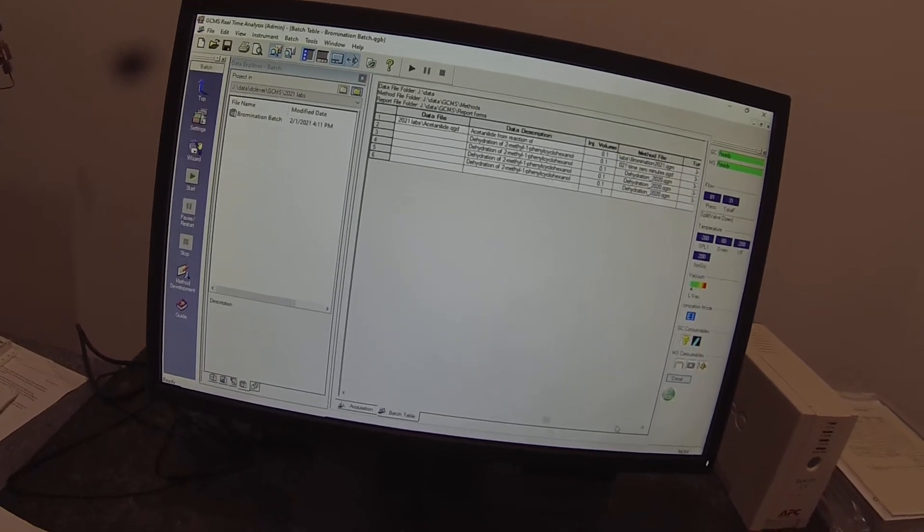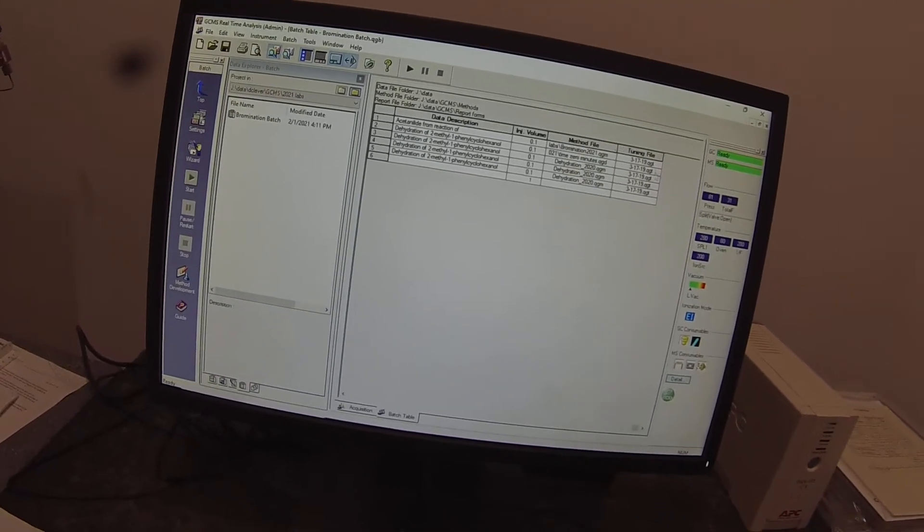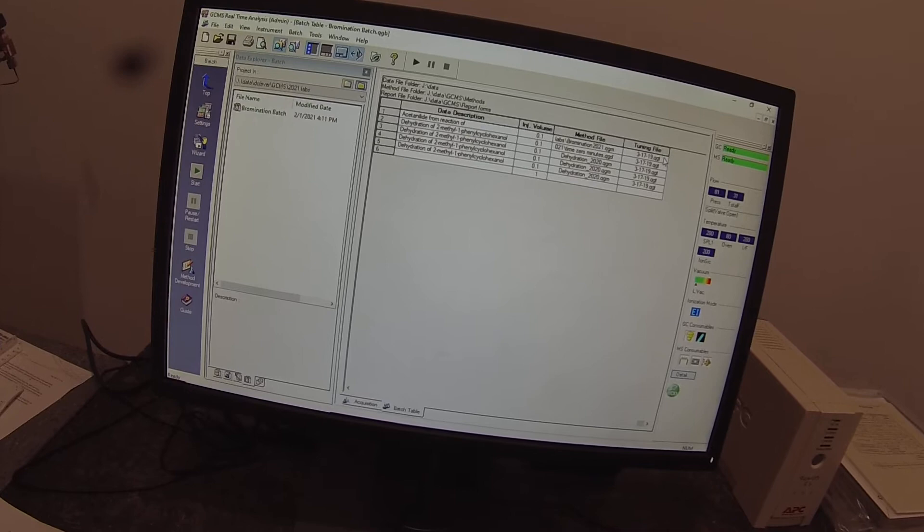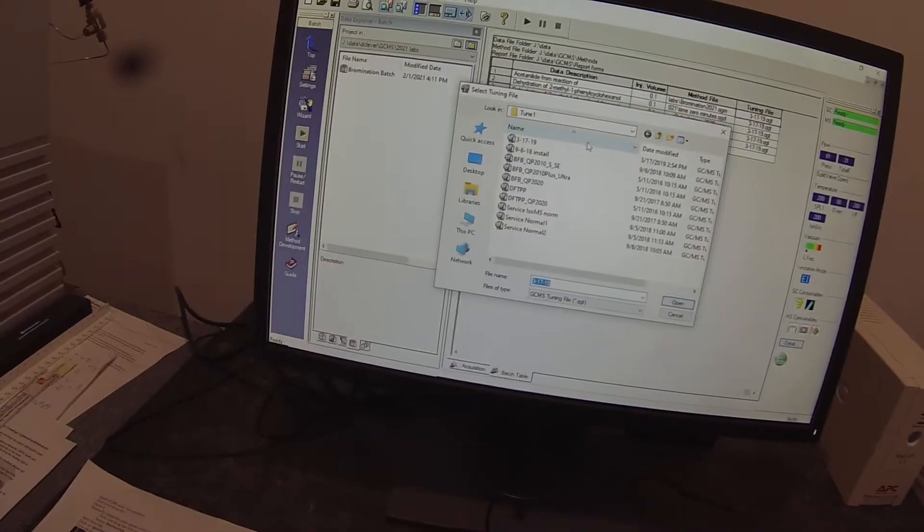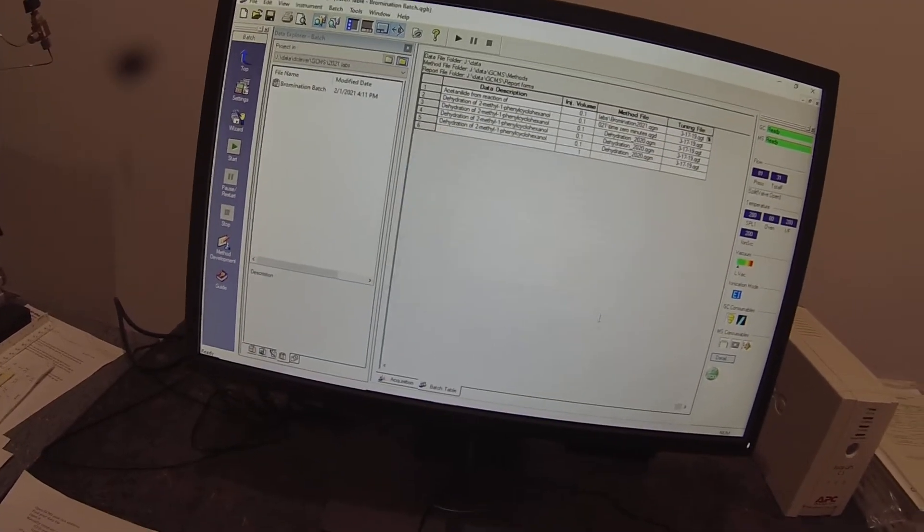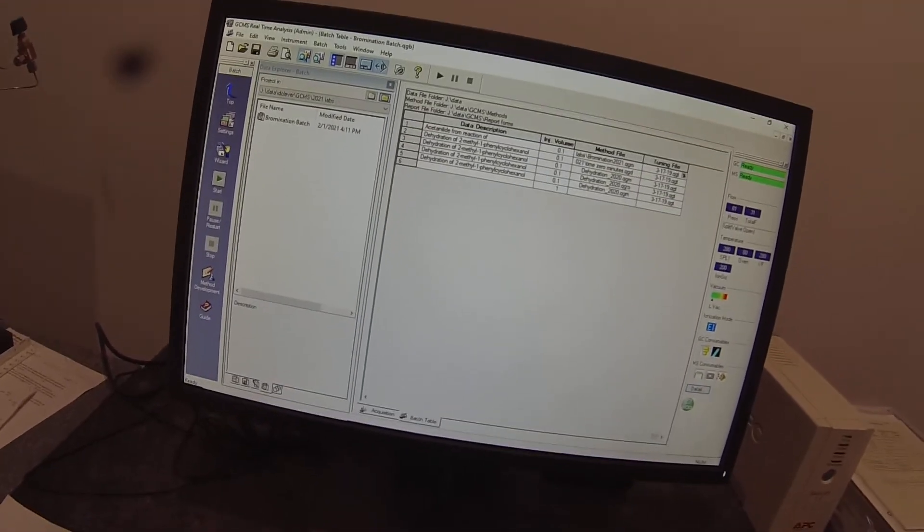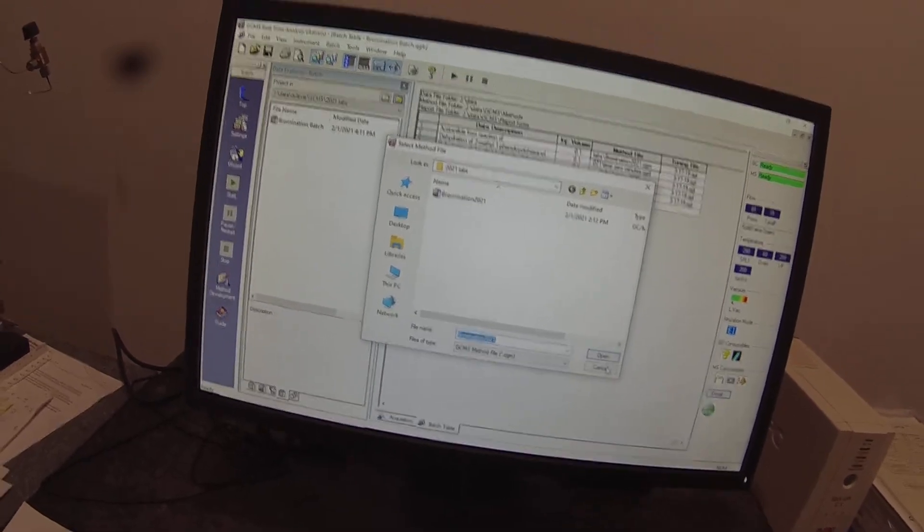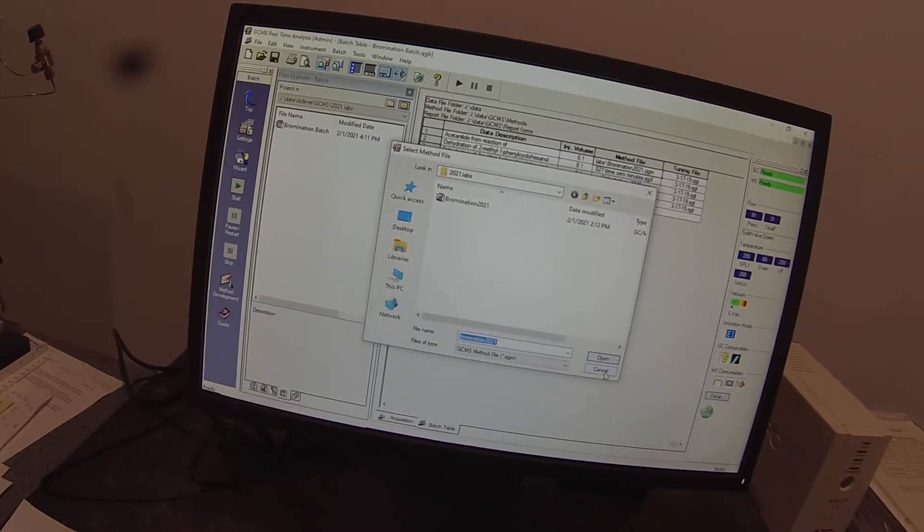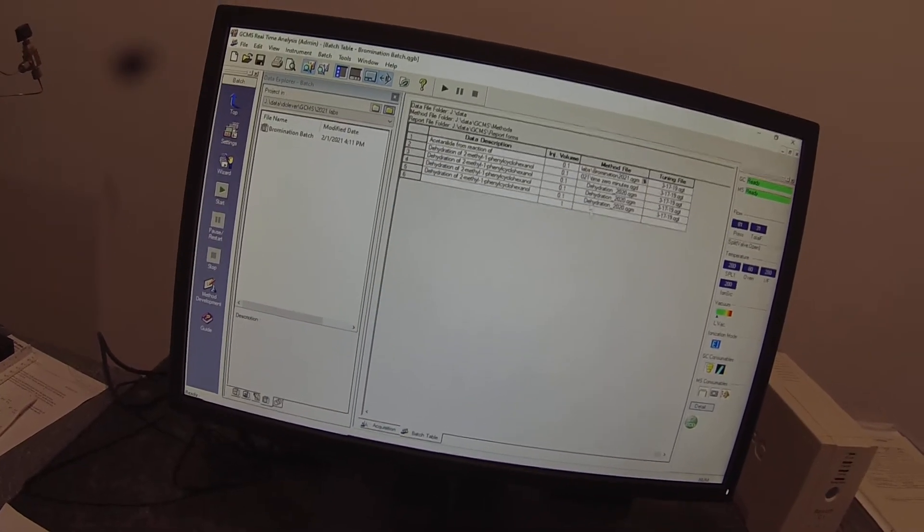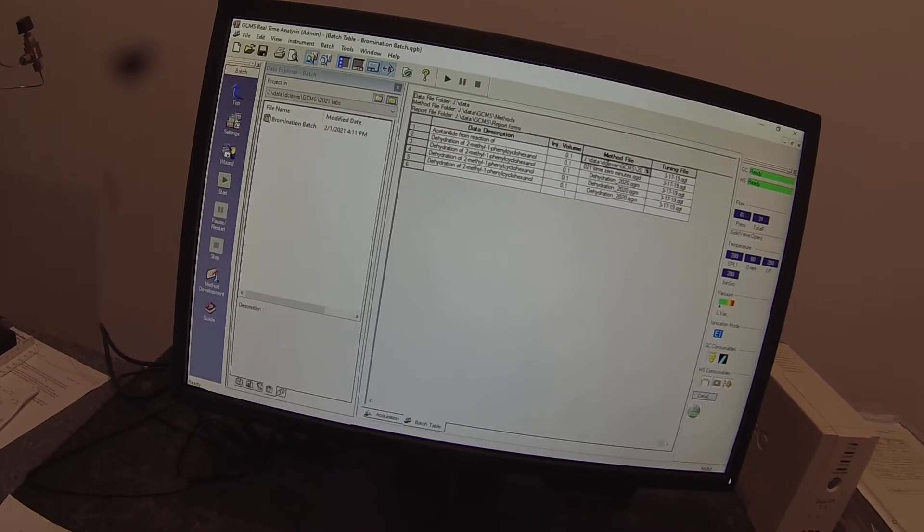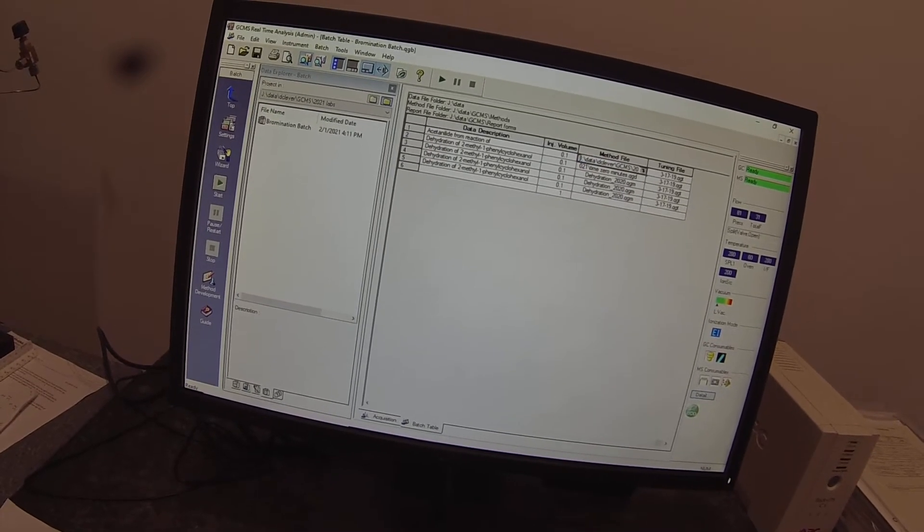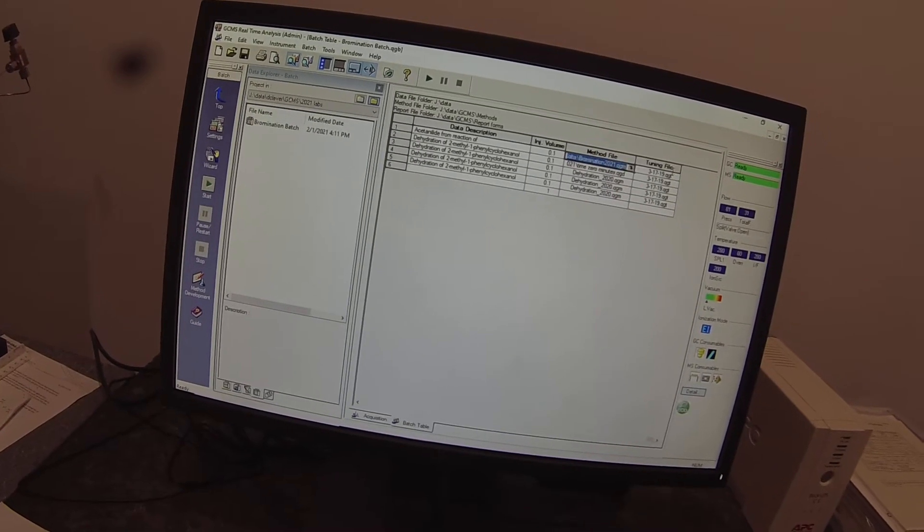Well, let's check the tuning file. Then we'll worry about it. 3.17.19 is the most recent date on the tuning file. So that's good. I want to take this and select the entire column. There we go.